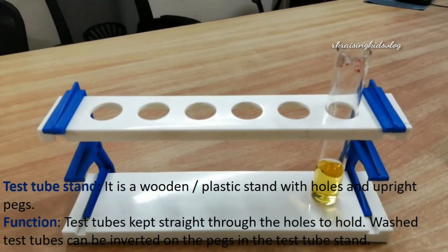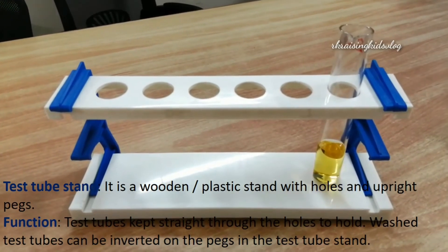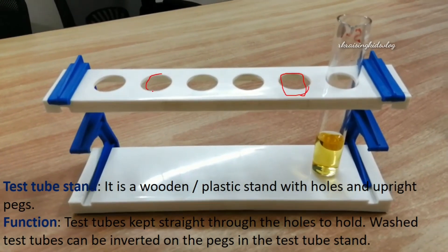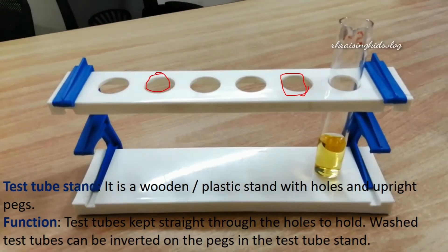Next, we'll know about the test tube stand. It is a wooden or plastic stand with holes and upright pegs. The holes are used for holding the test tubes — test tubes are kept straight through the holes. Washed or cleaned test tubes can be inverted on the pegs with the open end facing down and the closed end up, so that water runs down out of the tube.